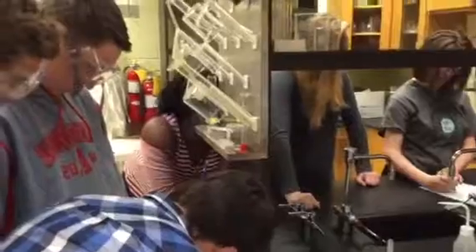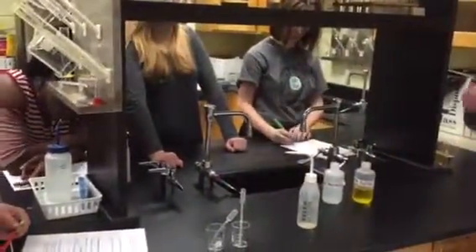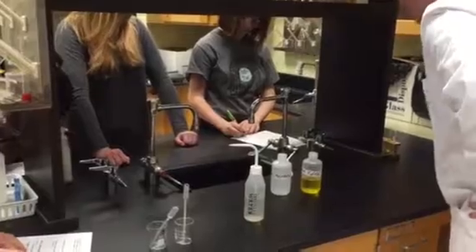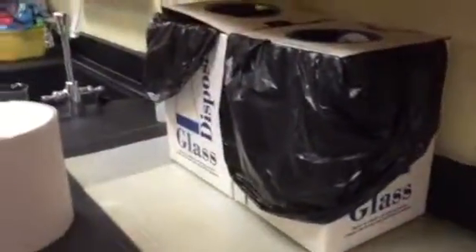Is everything else balanced? Pb? Looks good. So after that precipitate formed, you had that clear mixture turn to a cloudy mixture. Once this is done in the centrifuge, we'll see how it all looks.